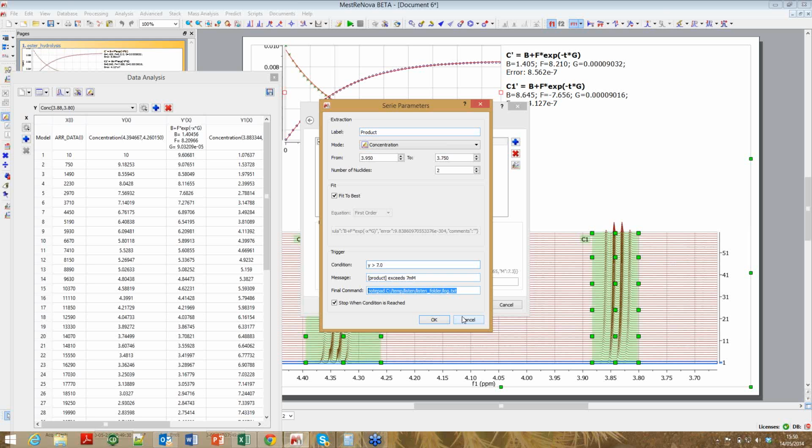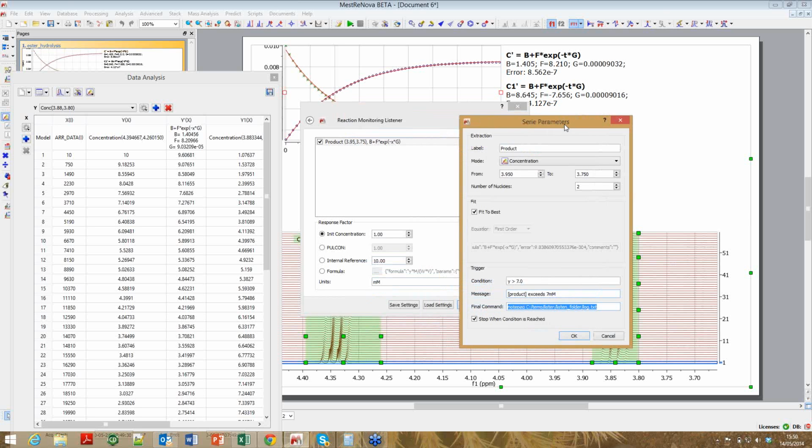And so it could be deployed in an environment where you aren't around and you want perhaps a less skilled person to operate this stuff.